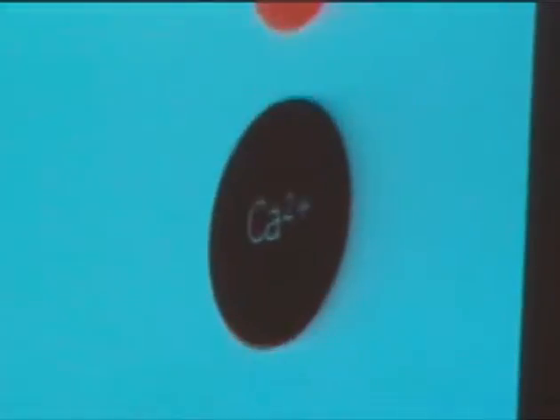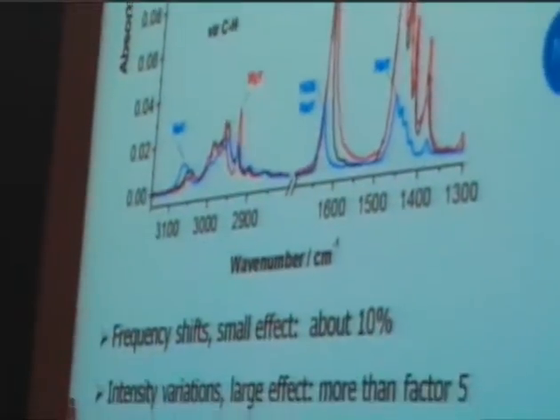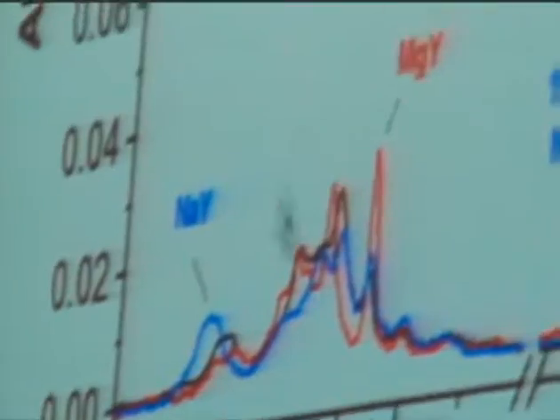We could just take one molecule and absorb it on different catalysts and see whether we get different intensity distributions. What was done here was that propene was absorbed on a series of zeolites Y that have been exchanged with different cations. And the adsorbate coverage was chosen such that the intensities here in the CH stretching regime are about the same.